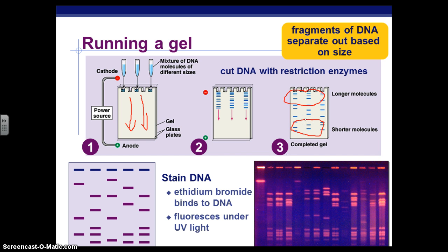The gel runs for about an hour. It's usually half an hour, but for some reason the gels that we have are slower. So we run them for about an hour. It takes about an hour to separate the bands of DNA, which we'll do on Thursday.